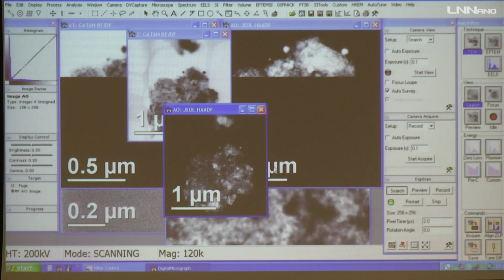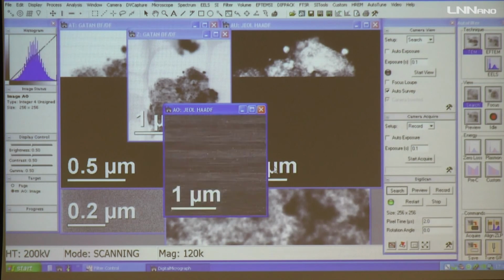It's very far from the center, and then it's not that easy. Yeah, I'm not sure if you can do it.